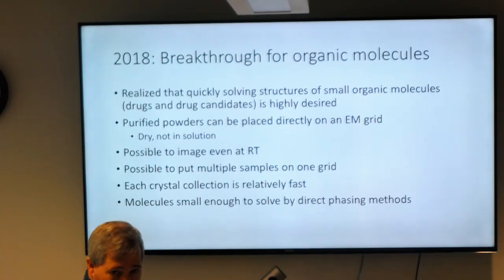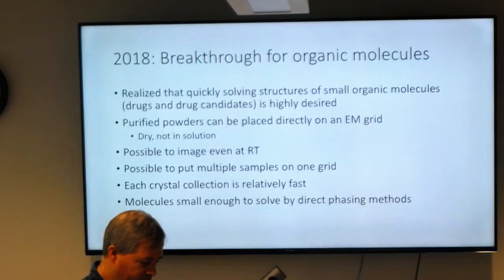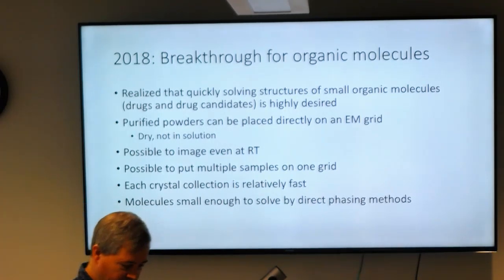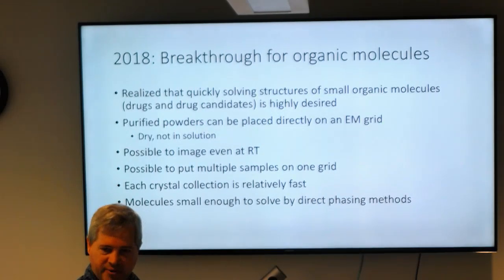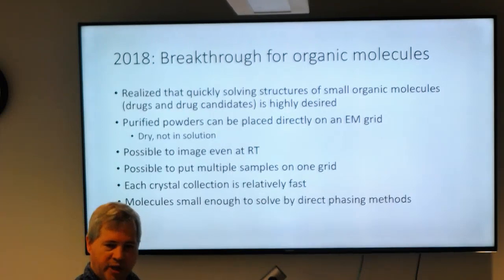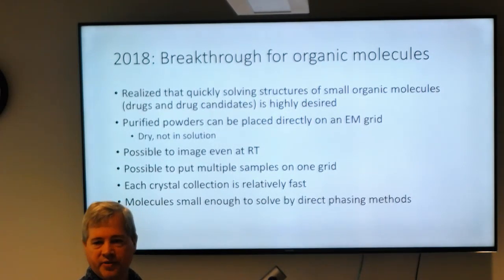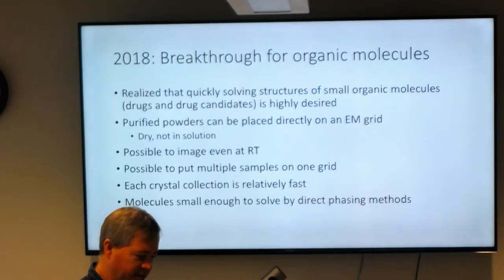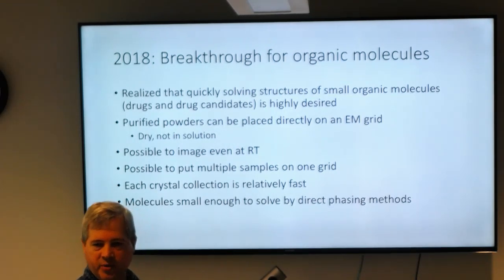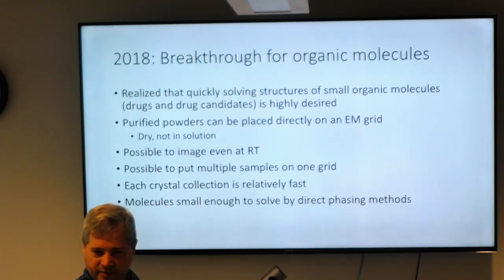So if you put a powder on a grid, how do you make sure it stays? Basically, what we did is we dipped the grid into a very fine powder of a pill we ground up, and then waved most of it off, and only the tiniest things will stick to it. They're stuck by van der Waals forces. So the bigger stuff should fall off naturally, and only the tinier things will stick. And they seem to stick pretty tightly.